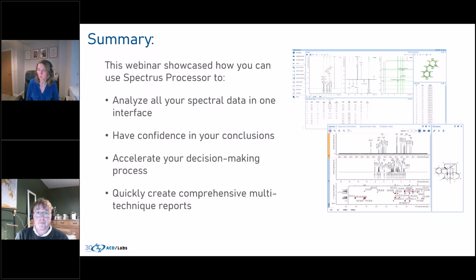When the carbon-13 spectrum is being auto-picked based on an HSQC, does it deal well with coupled peaks, for example, in 31P phosphorus NMR? That's a very good question. I don't have experience myself with handling that data. We can handle 31P phosphorus NMR data within the software, but I don't have particular experience with that data set. If the individual who asked that question would like to supply us with some relevant data, then we can test it out for them and see whether it works or not.